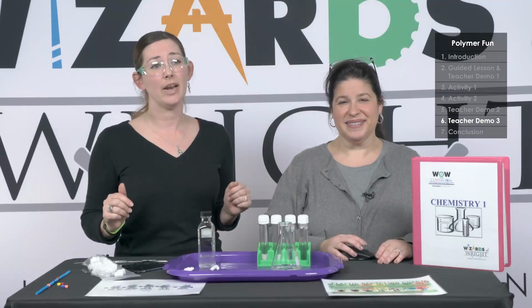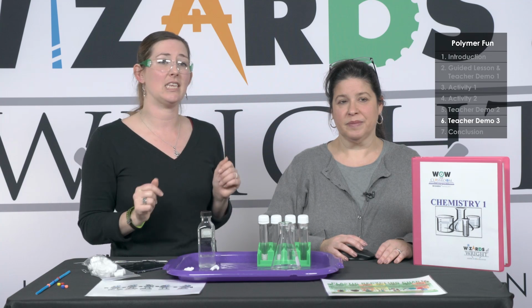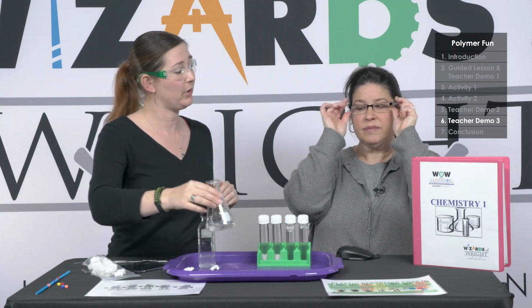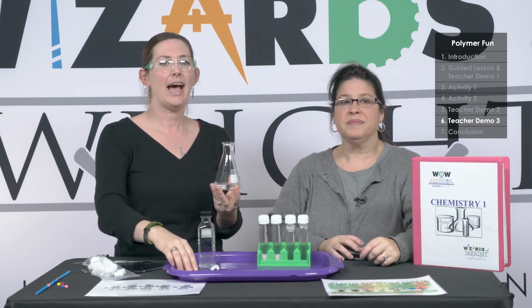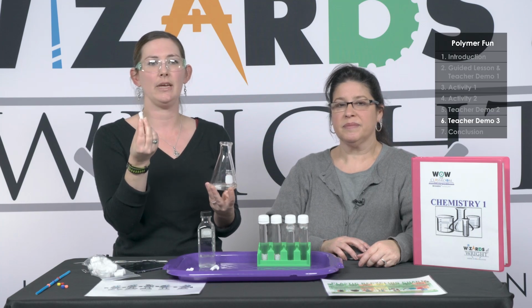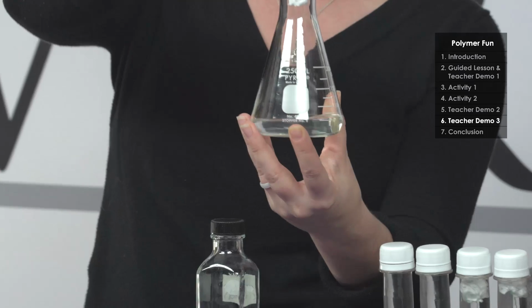Now, if time permits, you can ask a volunteer student to assist you. In this case, when handling this liquid, we need to protect our eyes. So both of you should put on your safety glasses. Ask the students to hypothesize or predict what will happen to this peanut when it's dropped in our chemistry fluid. Have your students drop one in.